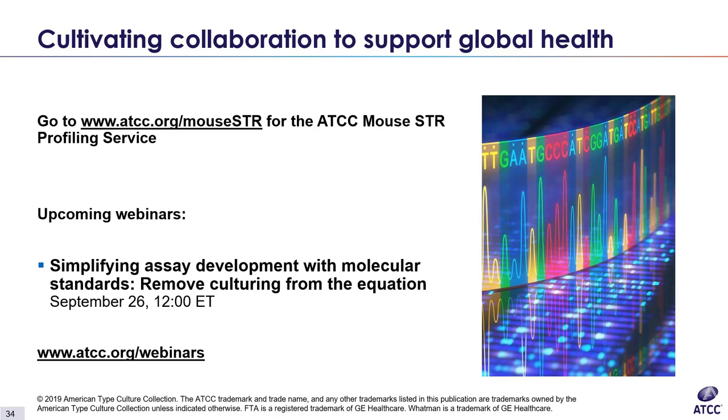That's good. I saw that it came in. They spelled it Y, question mark. There are over 100 reportedly male cell lines in our collection that appear to have lost the Y chromosome, and they'll only yield an X chromosome result for amelogenin. It turns out that only three of these were isolated from normal tissues. The rest of them are from tumor cells. But remember, you can still differentiate them from other cells by the other eight markers, right? Amelogenin is just really one marker, and we don't even look for that with the mouse STR.